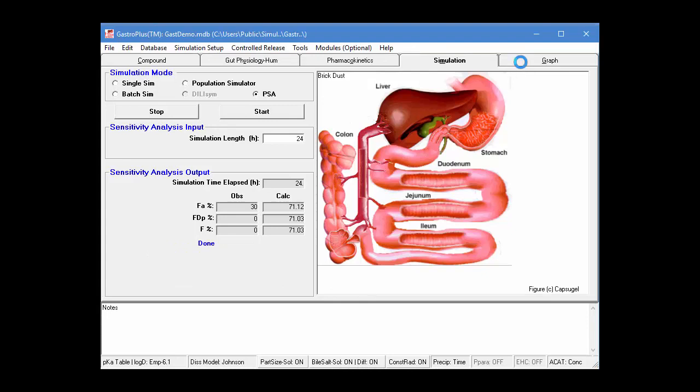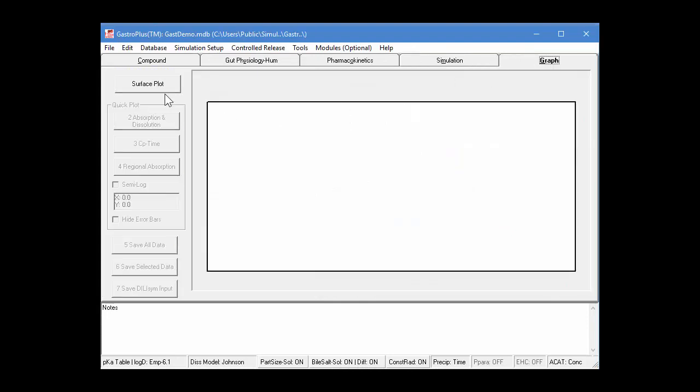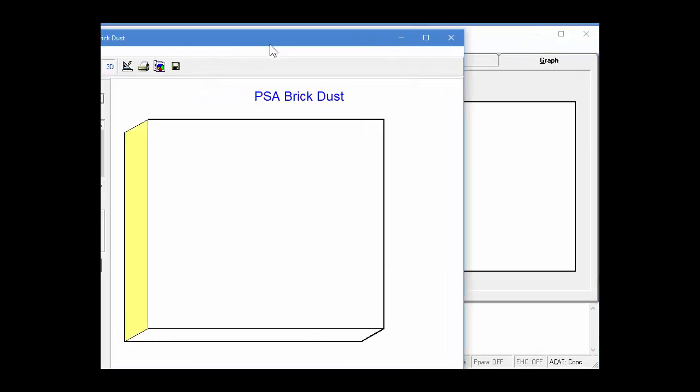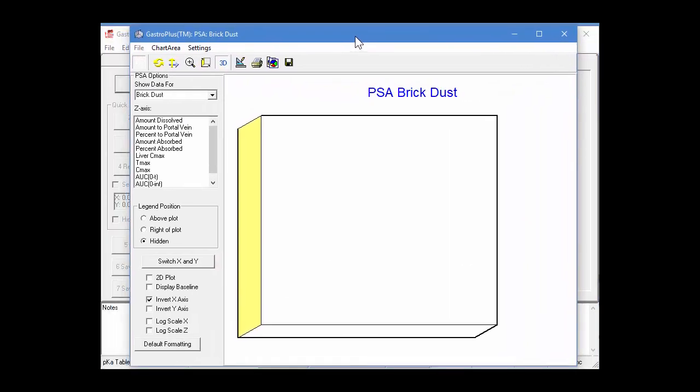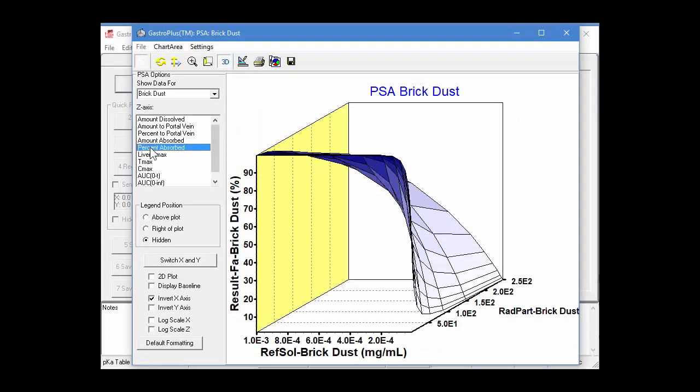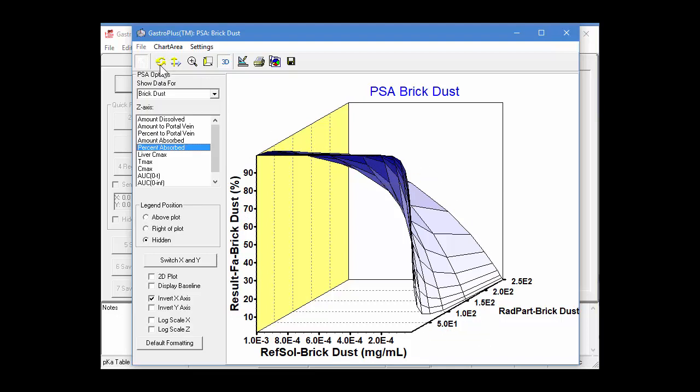So, we can go to the graph tab and, again, click on surface plot. And then select our PK property, in this case, percent absorbed or the fraction absorbed. So, it comes up on the Z axis here, and then the X and Y axis are the two parameters we varied. And you can see the graph.